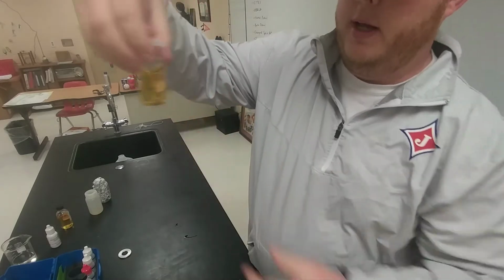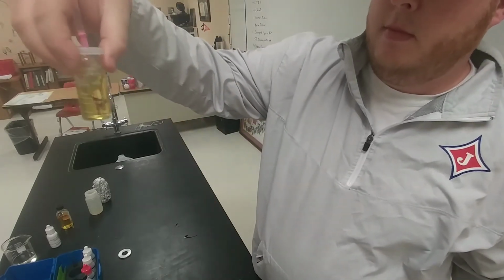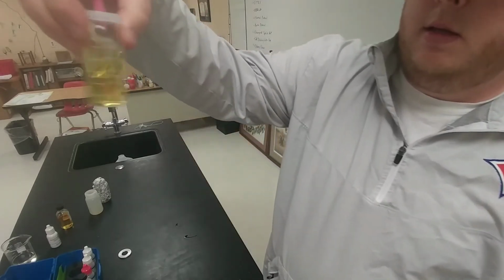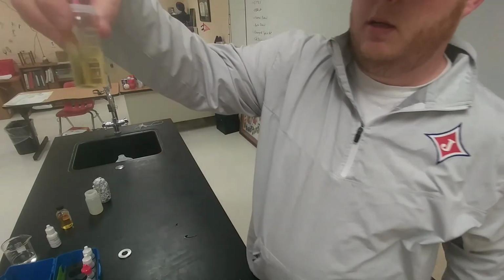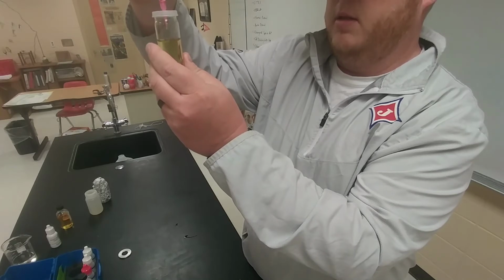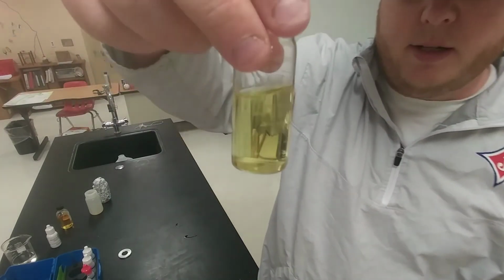It's probably a pretty arbitrary color. So it started to turn there a little bit. I'll just add a little bit more. Yeah, all right, we'll call that pale yellow. I don't know how much we had before, but instead of golden, maybe just a couple more drops, just to be on the safe side. There we go. That's pale yellow. Sorry if I've been over here, but I haven't really been paying attention. So we'll call that pale yellow.